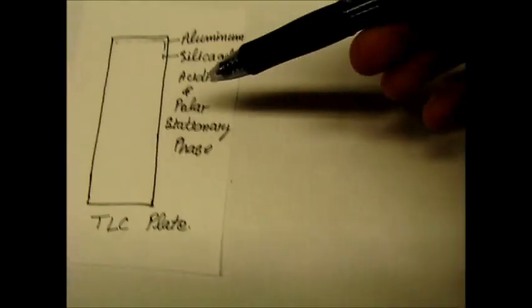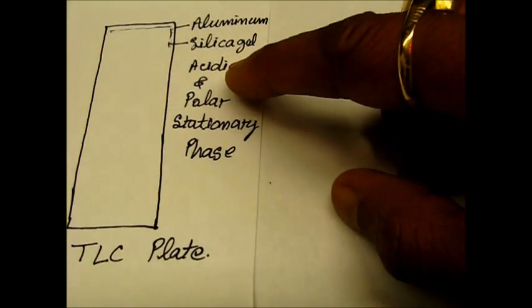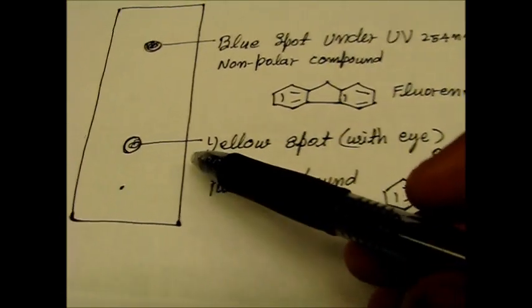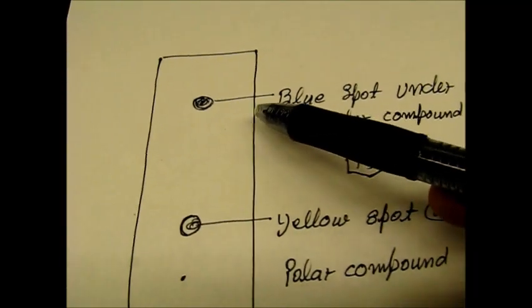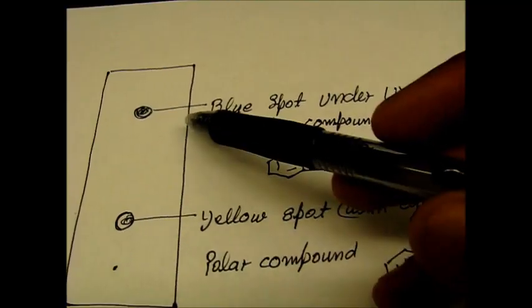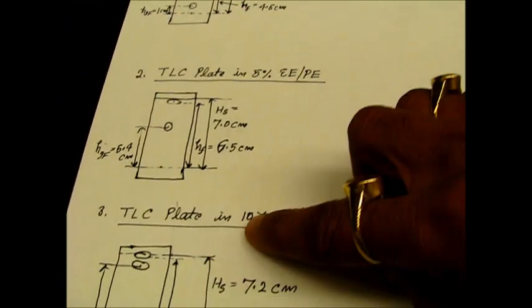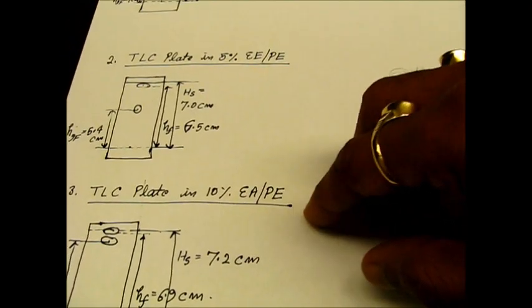Here you can see this silica gel plate. If you see this on the other side, they are all aluminum. And the front is the white part. This white part is the silica gel, which is acidic and polar stationary phase. That is why it retained the polar compound, which is the 9-fluorenone, at the lower height compared to the nonpolar compound, which is the fluorene, which goes very high. It is blue spot under the UV light. You cannot see it by the naked eye. The RF of the nonpolar compound is very high. Rather than five percent and ten percent, maybe we have to use only one percent and two percent ethyl acetate in petroleum ether.